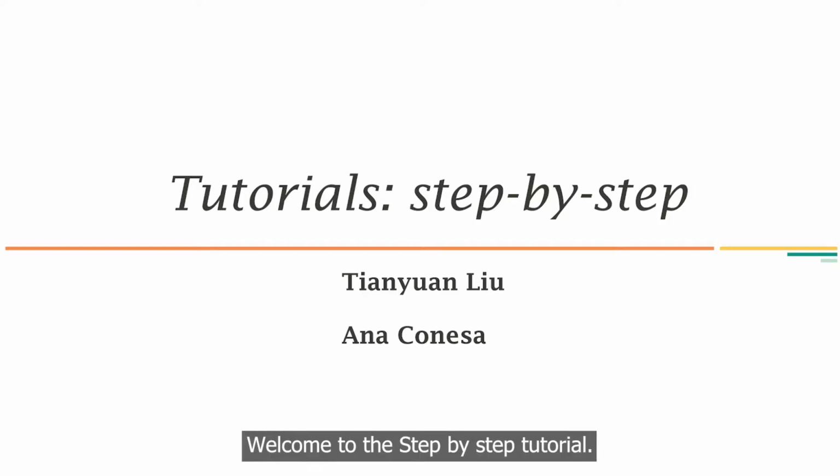Hello. Welcome to the step-by-step tutorial. In this tutorial, you will learn how to analyze different data types supported by PaintOmics.